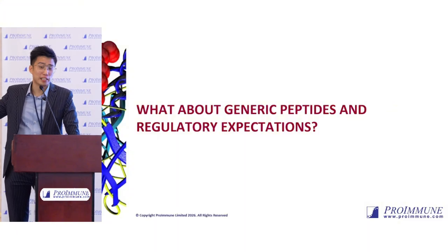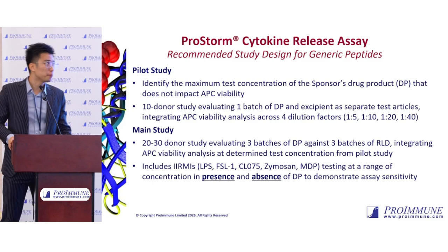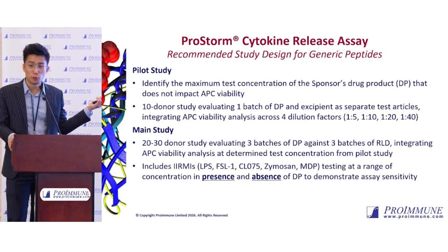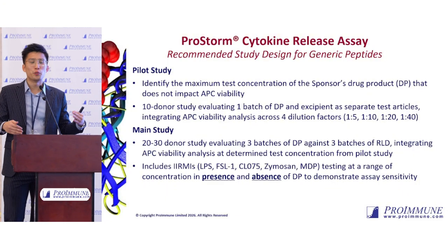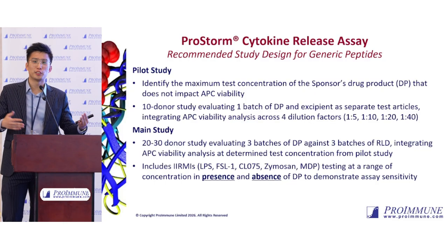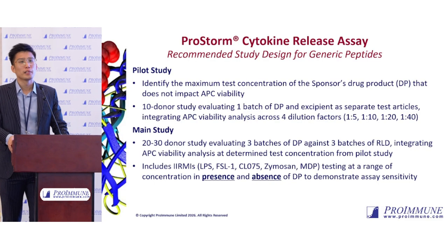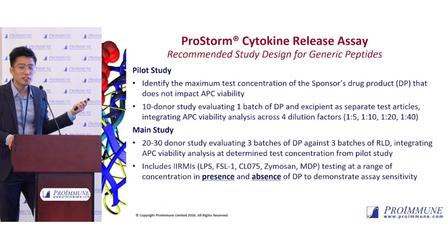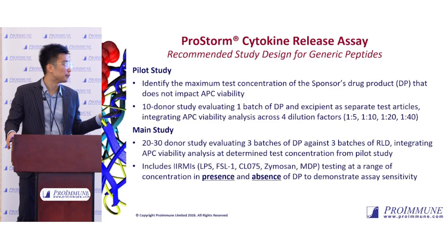So with that kind of evolutionary thinking, we have updated the assay along the way to capture the current FDA expectations. And this is our recommended study design for generic peptides. Here you have your pilot study, which is also a dose finding study, to identify the best concentration that we can proceed to the main study, where you compare 3 batches of drug product to 3 batches of RLD. The best concentration, by definition here, is the highest concentration that does not impact your cell viability.